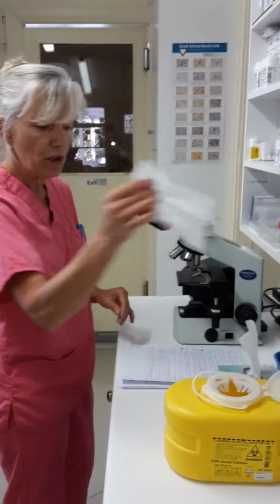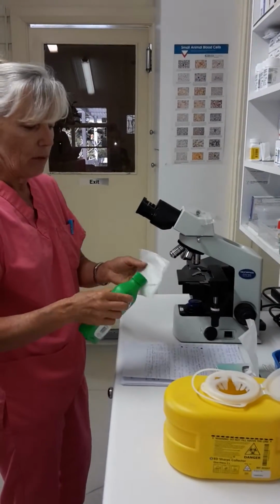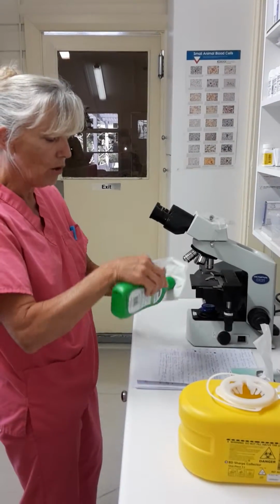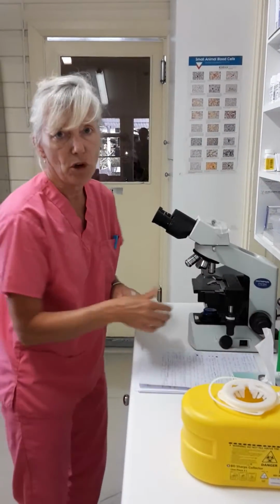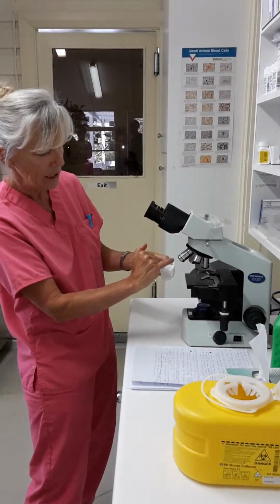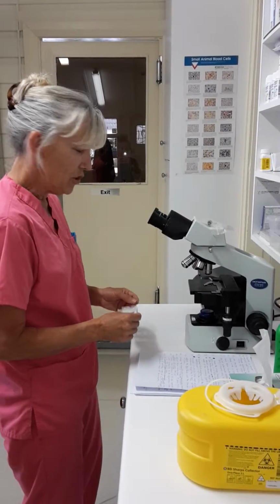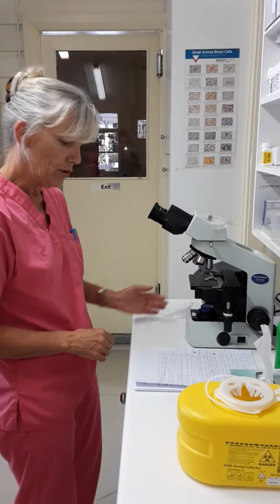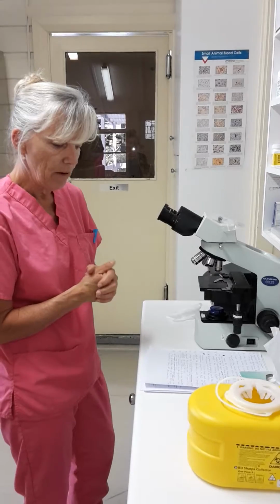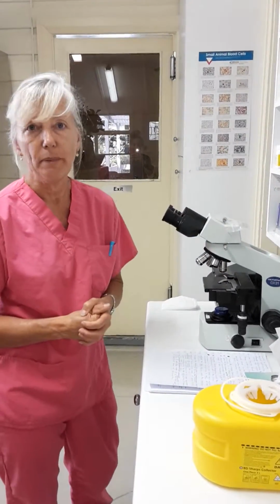Our clinic protocol is to use Kimwipes, which we would soak slightly with isopropyl, which is alcohol. My colleague has just done this, so I'm not going to do it again, and I'm not going to risk damaging the expensive equipment. But what we would be cleaning is our objectives, our stage, and our area down the bottom here. In terms of cleaning our bench top, we would use F10 at a dilution rate of 1 ml of F10 to 250 ml of water, and we would leave that on for a contact time of 30 minutes.